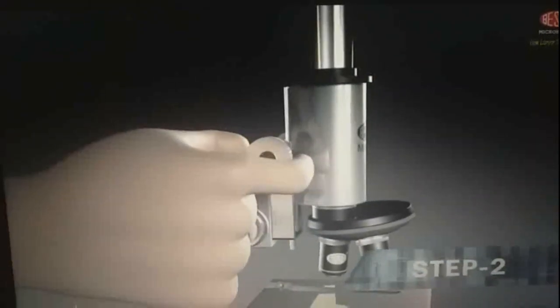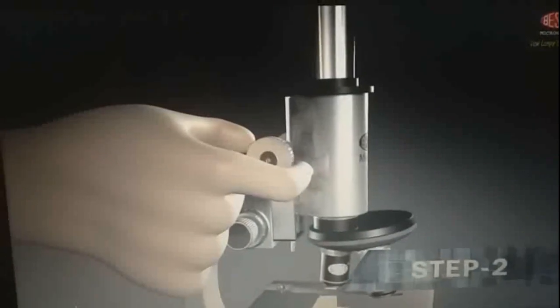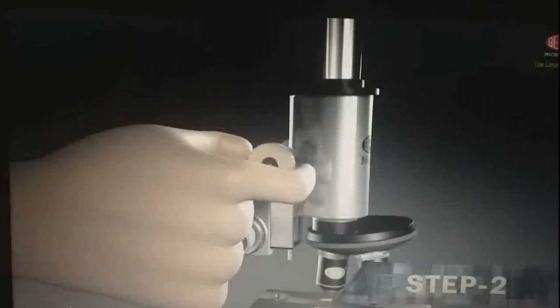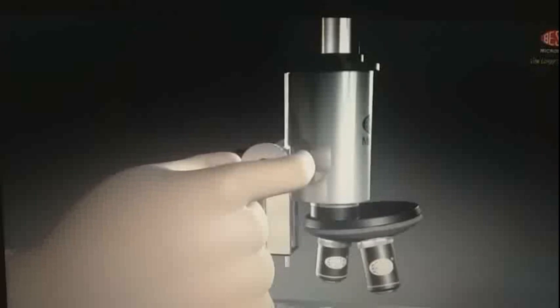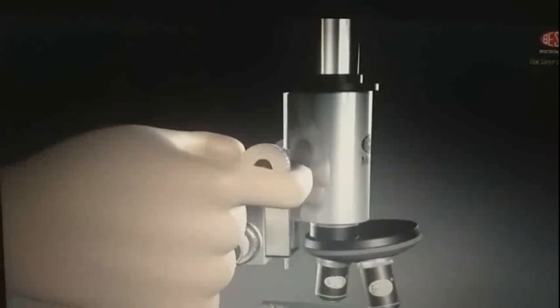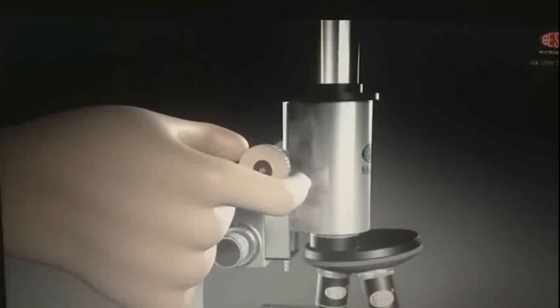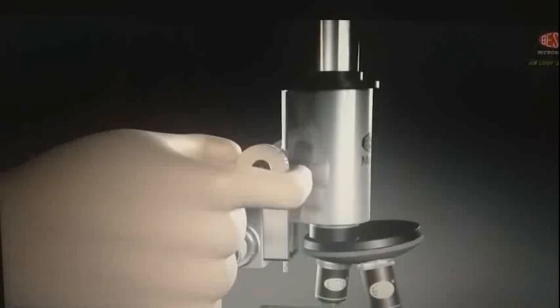Step 2. Make sure low power objective is in place over the hole in the stage. Use the coarse adjustment knob to raise objective. See here, when you move it clockwise, it will go downward. When you move it anticlockwise, it will move up.